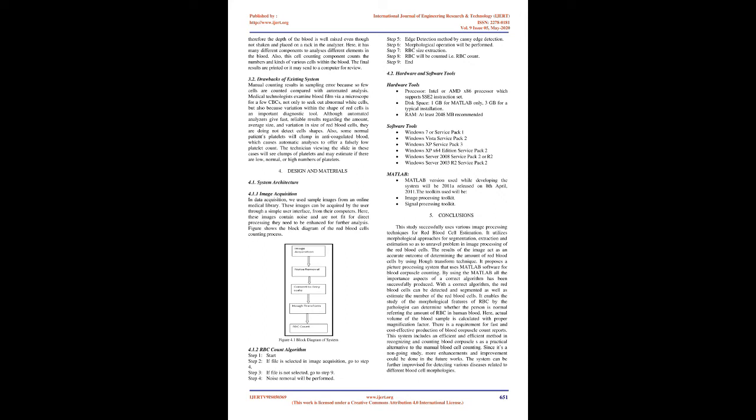The cell splitting process is accomplished by an implemented algorithm, which may be ordered as follows. First, the sites of the adjoining RBCs are detected, which results in cells with 2 consecutive boundaries, i.e. inner and outer boundaries. The next step is devoted to removing these outer boundaries. An image of separated RBCs will be produced.